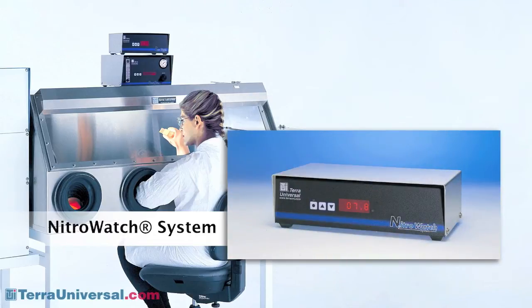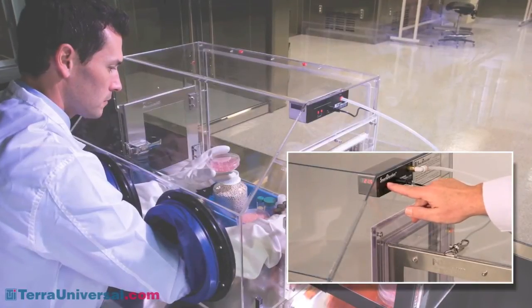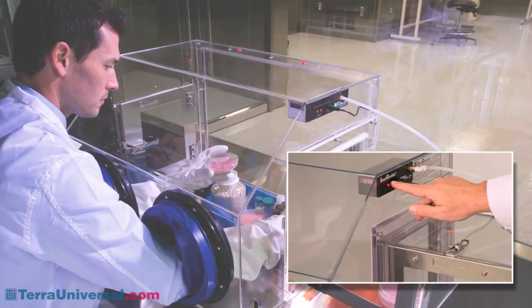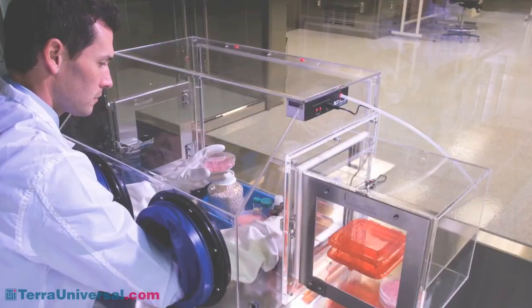The Nitro Watch controller adds humidity sensing and RH control capabilities, allowing you to maintain a humidity setpoint automatically. Tera's smart glove box incorporates these humidity controls into a turnkey benchtop chamber that's easy to set up and program for your humidity requirements. Smart glove boxes are available in acrylic, static dissipative PVC, polypropylene, and stainless steel.